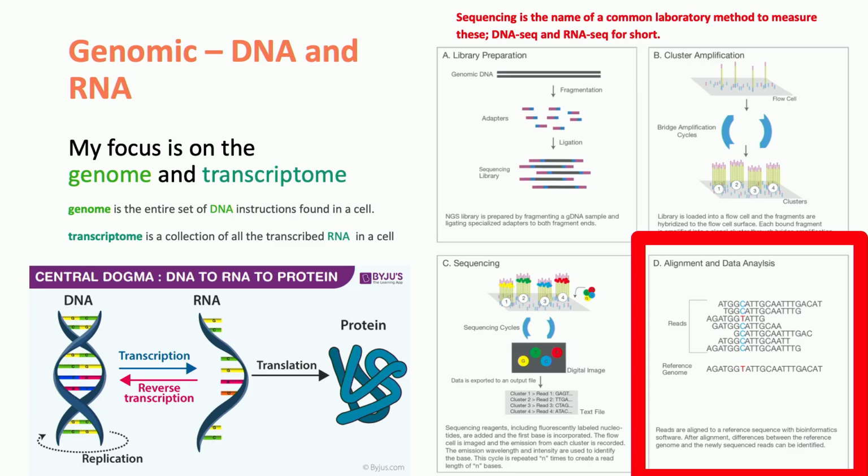So there's some library preparation, DNA or RNA is pooled and then it's sequenced, so typically there's fluorescence that happens, and the fluorescent signals are then converted into the 4 DNA bases, As, Cs, Ts, and Gs, and that's what you do your analysis in.